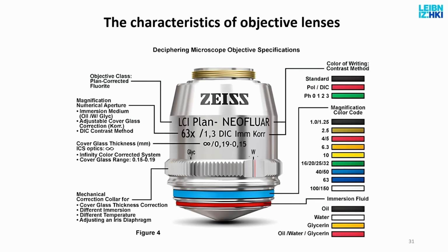So first of all, you have who made the lens, of course. And these are the values, or this is the information which will tell you what optical aberrations this has been corrected for. When you read it from the lens, you go and Google it, or you go to the Zeiss website, for example, and you check out how much compensation was done.